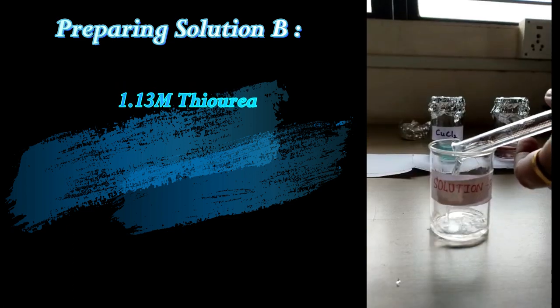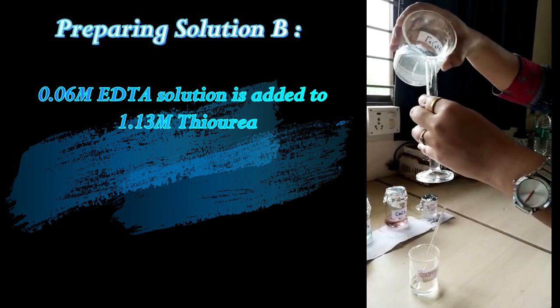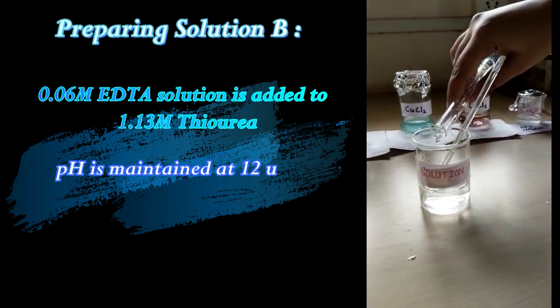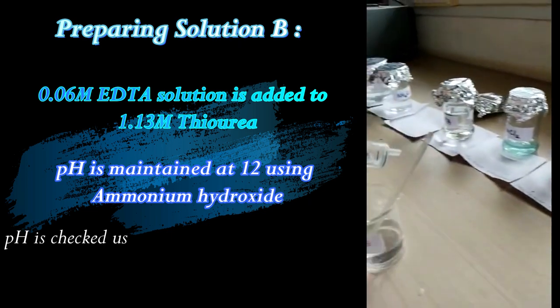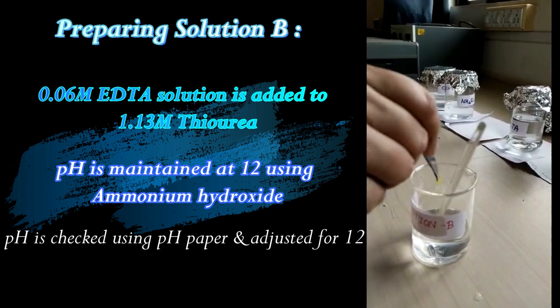To solution B, EDTA is added which is going to act as a complexing agent. This slows down the process and helps in uniform deposition of thin film. Here again, using ammonium hydroxide, pH is maintained to 12, which can be checked using pH paper.